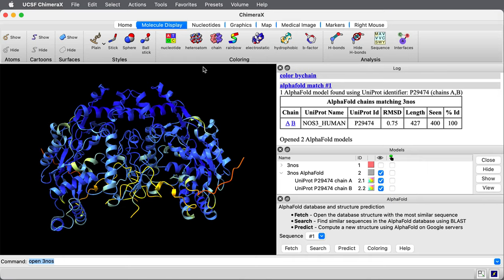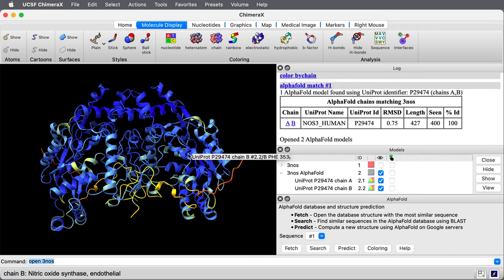The AlphaFold prediction only predicted the monomer and this fetching tool that we just used fetched two copies of it and aligned it to the experimental structure. AlphaFold did not predict the dimeric form.